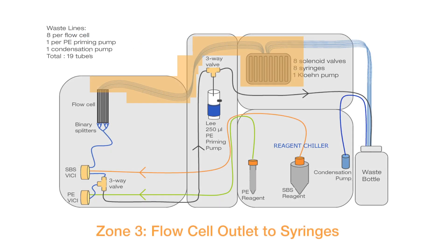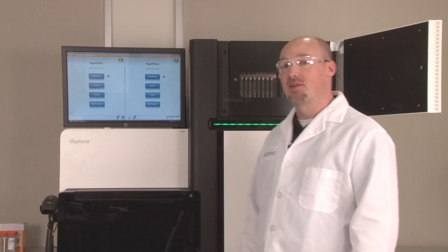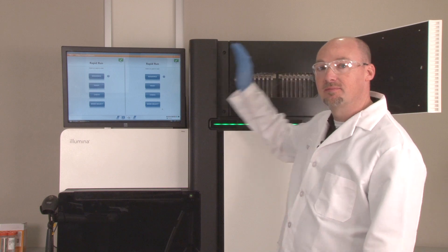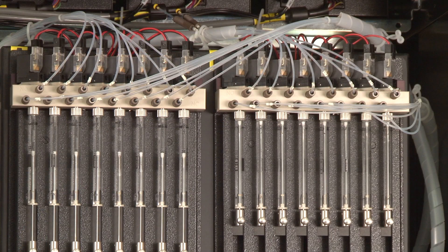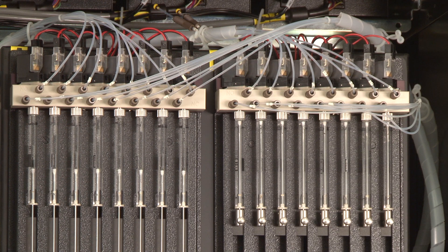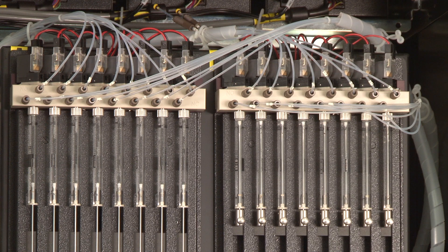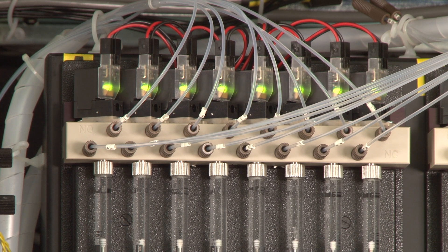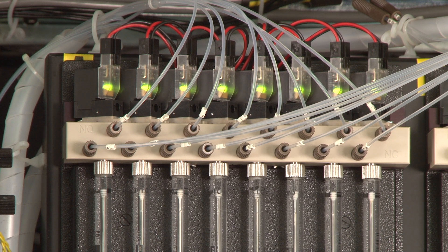If the clog is in a single lane and there is backflow associated with it, then it is likely that the blockage is from the back of the flow cell to the syringe pumps. Monitor the syringe associated with the blockage while pumping and check for large air gaps. If air gaps are seen, perform an instrument wash to push the air to waste gradually. Ensure that the solenoid valves atop the syringe pumps are functioning properly and switch positions — the solenoid should click and change LED indicators when working properly.